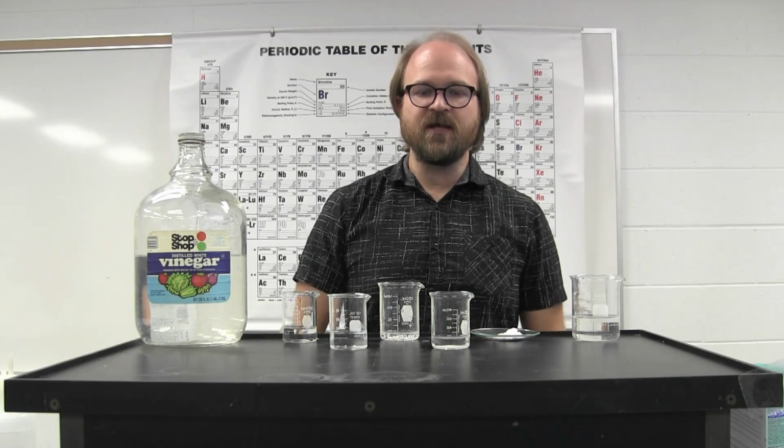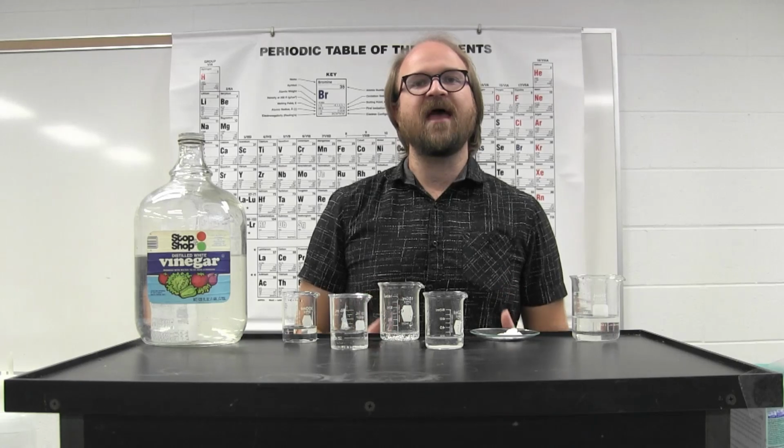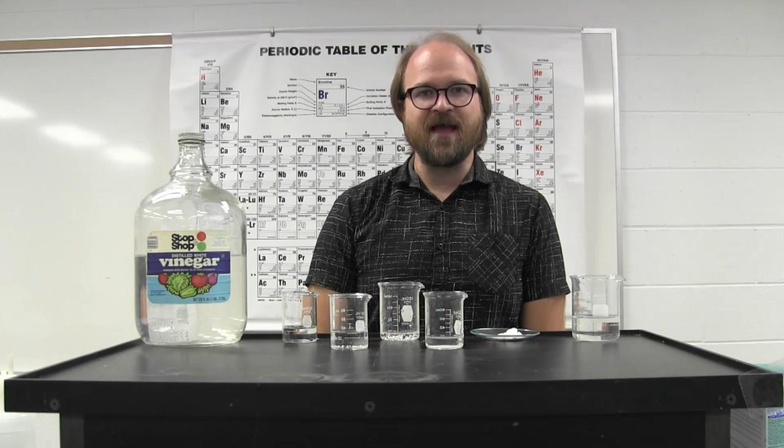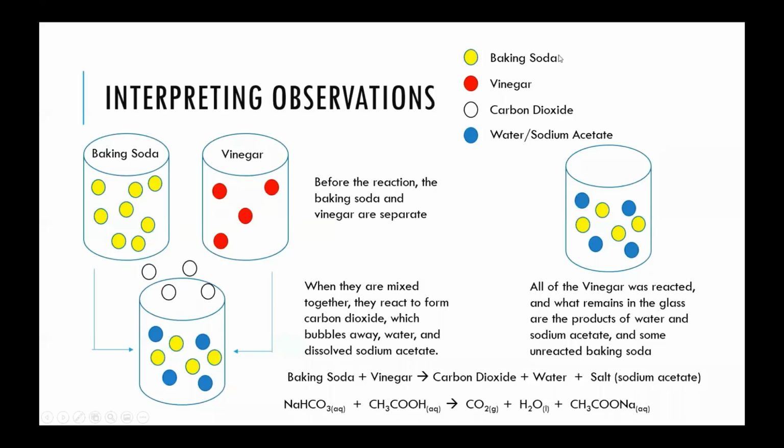Looking at that reaction and then performing the secondary reactions to see in that particular combination what is the limiting reactant. So just like part B, you're separating the final product into 2 portions and then adding additional reactant to each of them to figure out what was the limiting reactant initially.